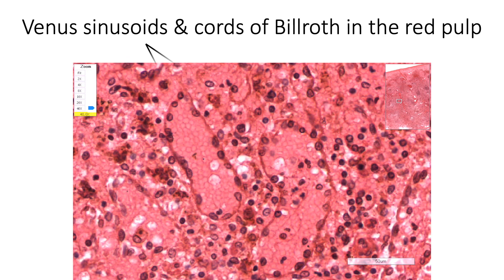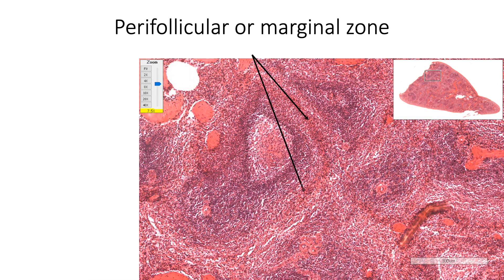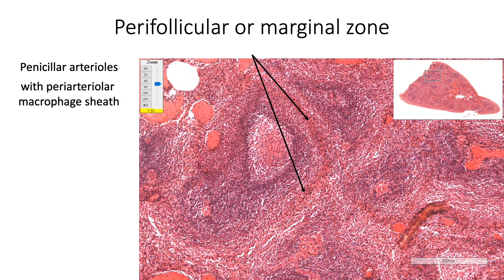Here we are seeing the venous sinusoids and cords of Billroth in the red pulp. Between the white pulp and the red pulp, there is a perifollicular zone or the marginal zone. This has penicillar arterioles surrounded by a peri-arteriolar sheath of macrophages. Lymphocytes are loosely arranged here in the reticular network, and blood enters the open circulation of red pulp from these penicillar arterioles.